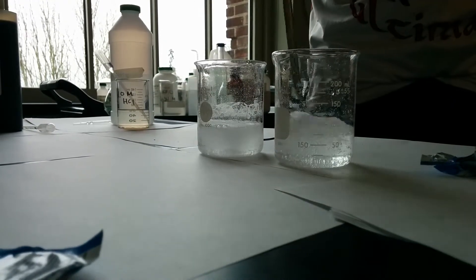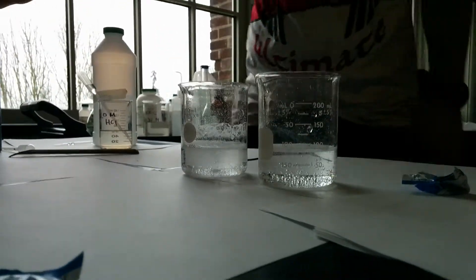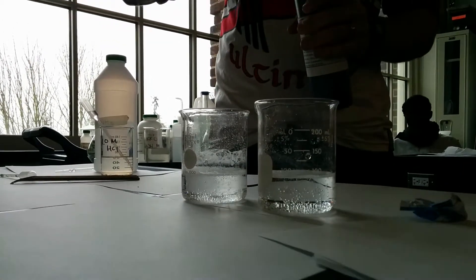Now that I've kind of stirred this up, let's make a prediction. Do we think this is going to be acidic, basic, or neutral? We added Alka-Seltzer, which is a buffer.